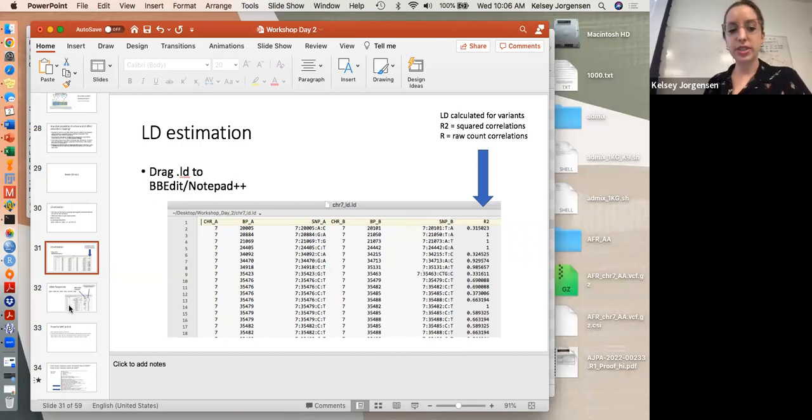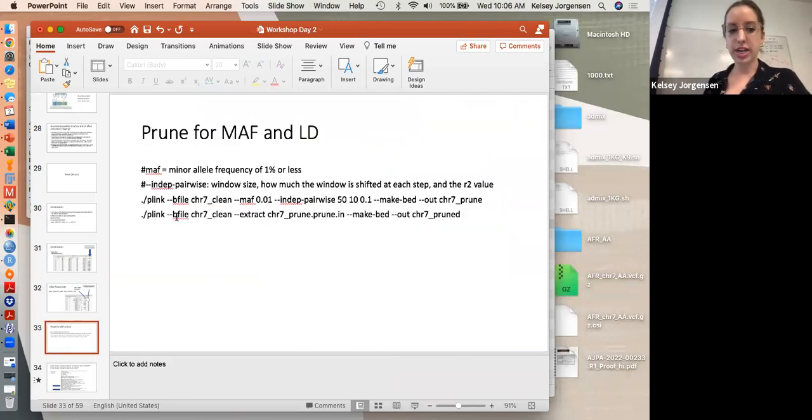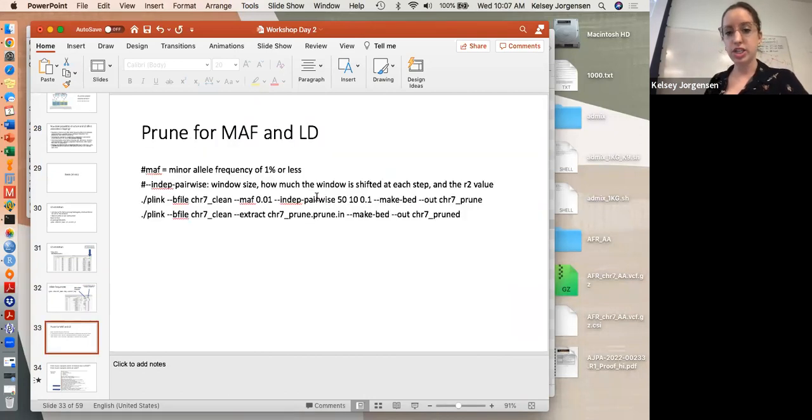Yeah, so these 2 steps that we did don't actually do anything to the data. It just kind of lets you look at it. And if you want to adjust the threshold, it's just a good check to see what you need to adjust by. Like, say you don't want it as stringent because it would prune a lot of your markers. So you could adjust this to, instead of 1%, 10%. But if you already know the threshold you want to use and it's kind of a set pipeline for your method, then you don't have to do those steps at all. You can jump right into pruning.